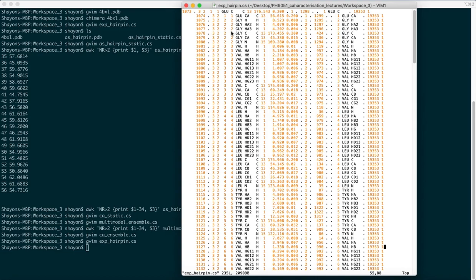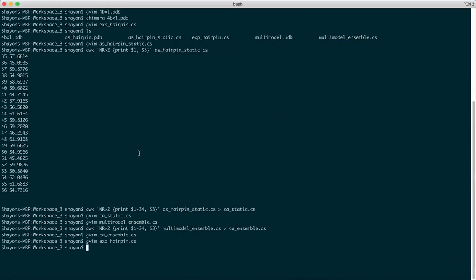But then again, if you want to make a selection for only the C alpha atoms from here, let's say, so we need to pick this 1, 2, 3, 4, 5, 6, 7, 8th column as well, and annotate those as C alpha atoms, and their corresponding residue IDs will also get picked in that manner. So we need to do a selection for the C alpha atoms based on the 8th column out here. So we can achieve that by writing a small awk script again.